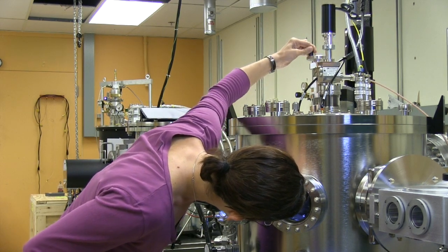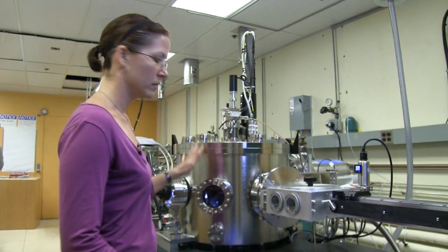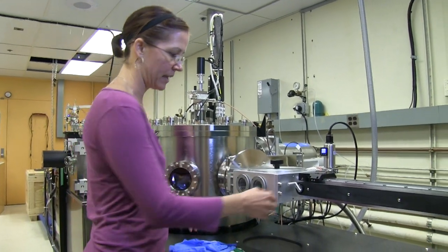And then I bring it back up slowly, making sure that it disengaged. And now that I can see that it disengaged, I go ahead and move it all the way back up. So now the sample holder is on this arm, and I'm going to rotate it back out.